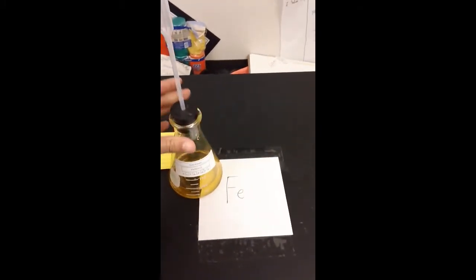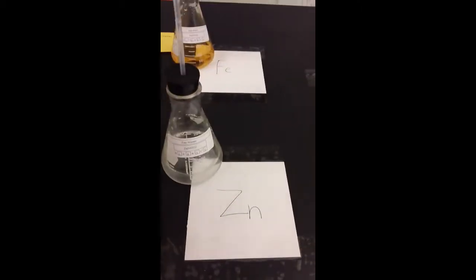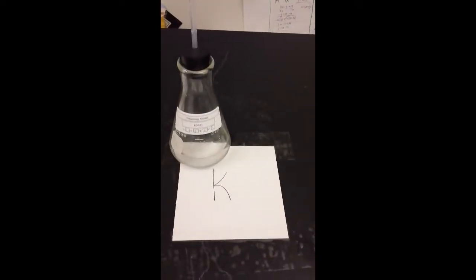We have over here iron nitrate, Fe for iron. We know this one is zinc nitrate, Zn. And then over here we have potassium nitrate, which is K.